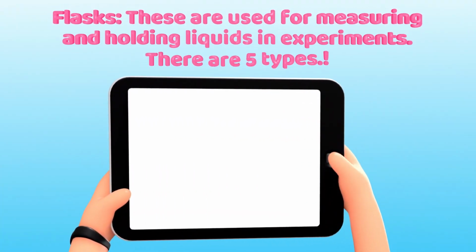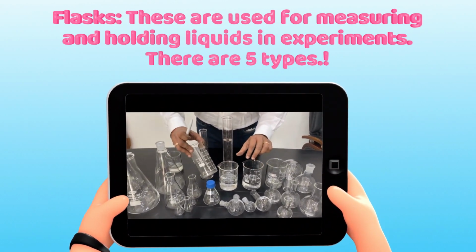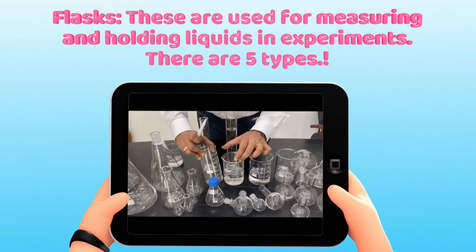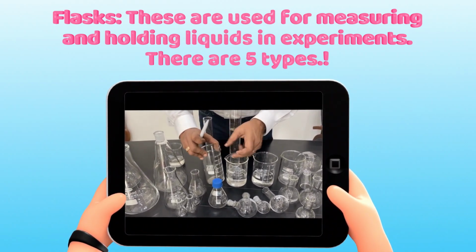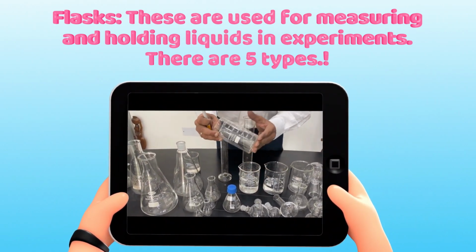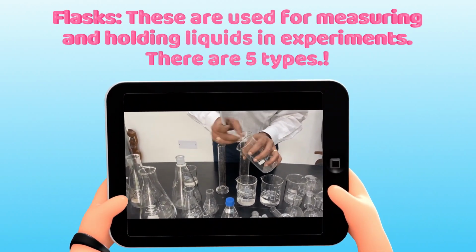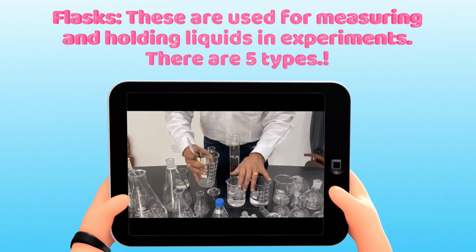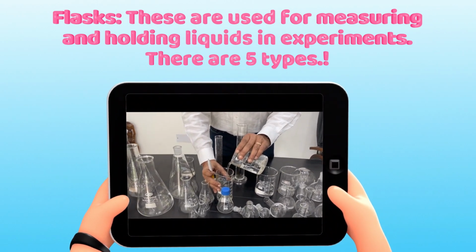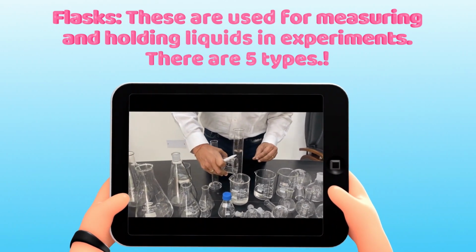Let's now see flasks. These are usually used for measuring and holding liquids during experiments in the laboratory. There are usually 5 types. We have the one used for volumetric analysis, another used for distillation, another of conical shape, another which is round-bottomed, and another which is flat-bottomed. We will see this in the next slides.